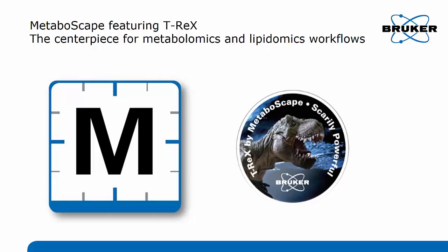Hello and welcome everybody to this short video on Metaboscape featuring the T-REX algorithm, which is a centerpiece for metabolomics and lipidomics workflows.